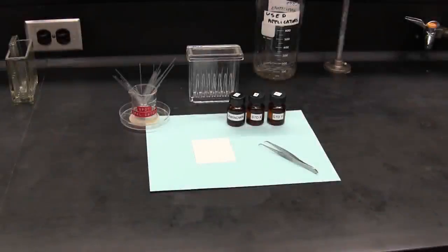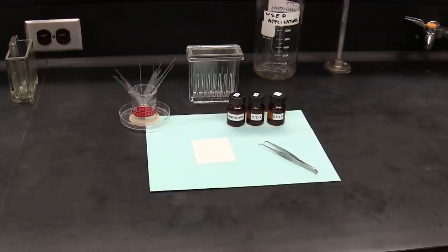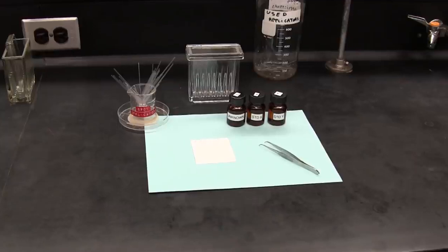Thin-layer chromatography, TLC, is a method used for rapid qualitative analysis, where components in a mixture can be separated and identified. This video is focused on the general method or procedures used in TLC, and for information on the theory, you can check out your lab manual or lab guide.